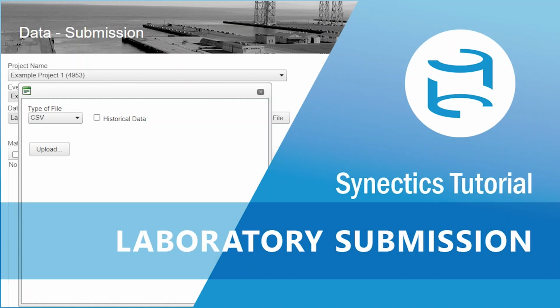This video will go over the basics of submitting laboratory data to the database. After sampling has taken place and data has been analyzed, the lab will submit an electronic data deliverable, or EDD file, and a laboratory report PDF. The database extracts the information from the EDD into data tables that it can use to generate reports. This process depends on the file having the correct structure and using valid values that the database can recognize.